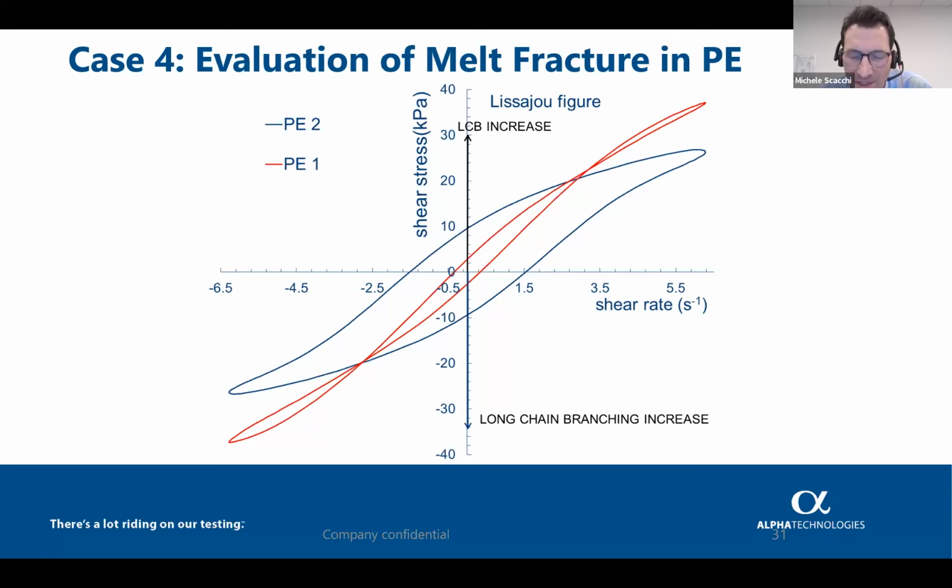We saw some studies showing that LAOS probably shows the same trends, but in terms of time, it is faster and easier to deliver results. So it's possible to correlate the strain hardening with the LAOS or the long chain branching indexes. In several cases, the customer prefers to use LAOS in order to get the results faster.